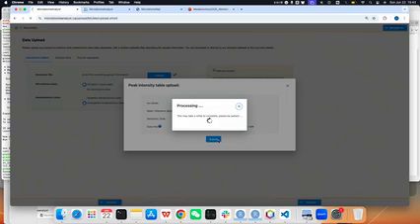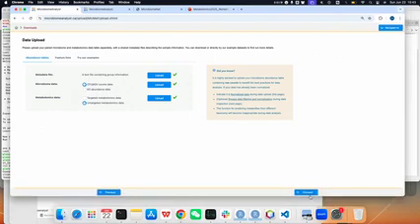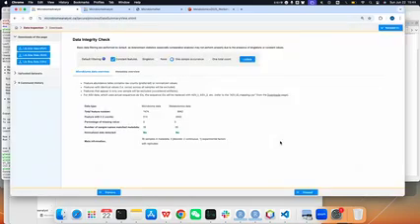When we upload, there may seem to be a lot of stuff here, but you can focus only on the data tab you are interested in. And next, we will also go to the summary page to see the details in our data set.